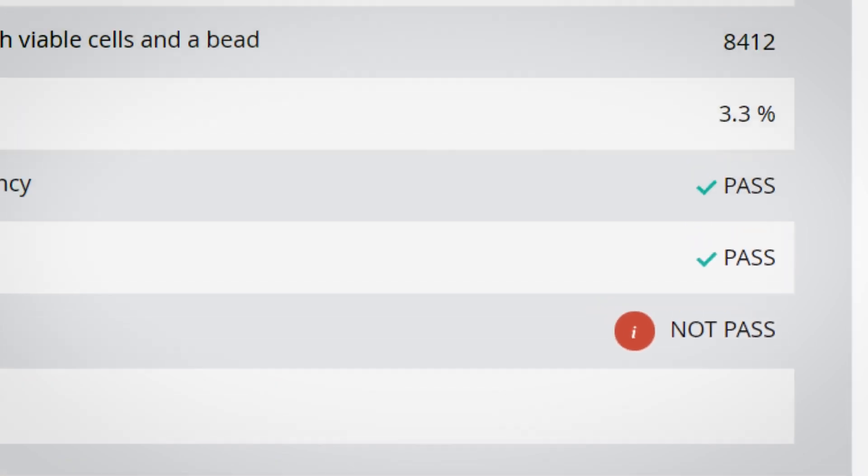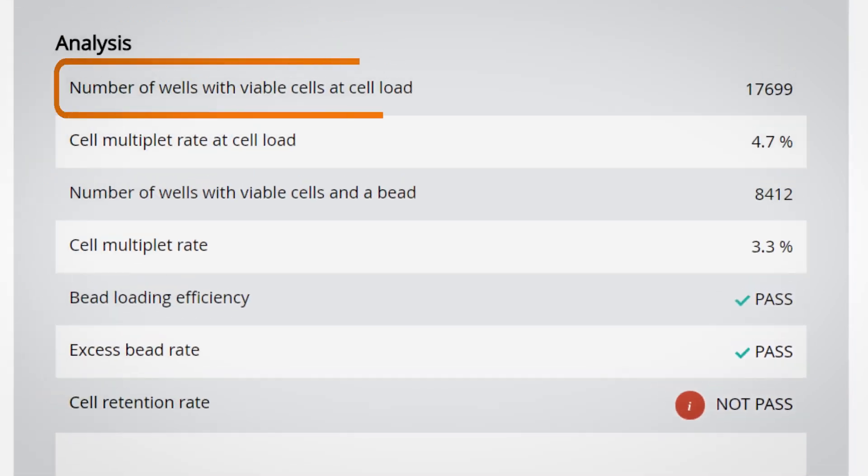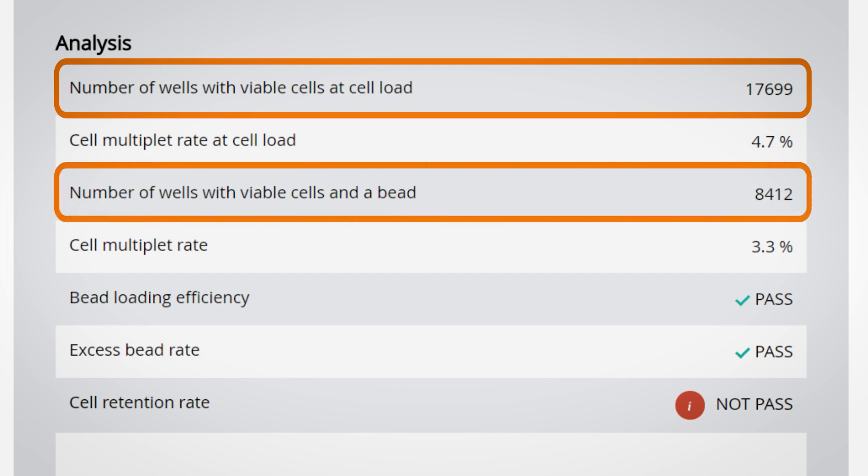In this example, we loaded 20,000 cells and captured 17,699 at initial cell load, which is a good capture rate. However, after bead loading and washing, we only have 8,412 cells left in the cartridge with beads. This is a very large loss of cells and is further punctuated with the cell retention rate not passing. Again, we can stop the experiment if this is an unacceptably large loss of cells.